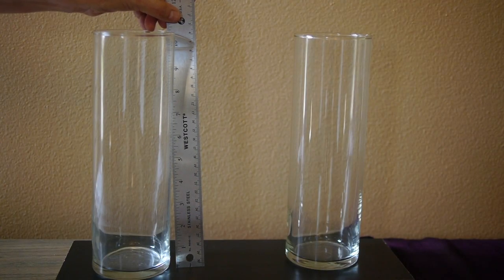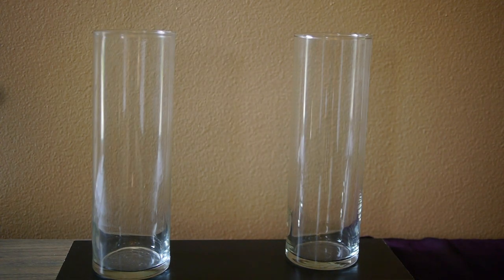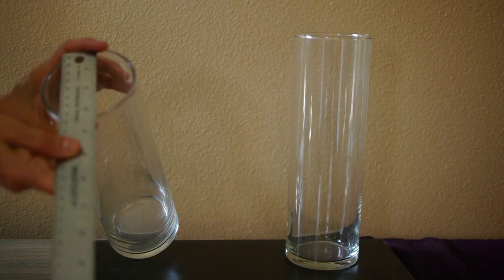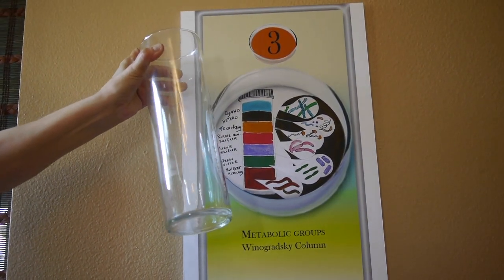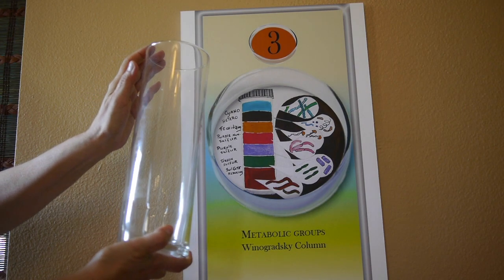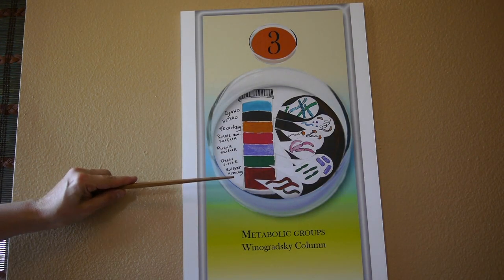You can create this system in a clear glass cylinder like this one, which happens to be 10.5 inches long and about 3 inches in diameter. With this simple yet elegantly contained mini earth, micro whisperers can experiment with different types of light and different types of materials added and be able to observe without a microscope how the microcosm responds by noticing differences in the colors and textures of the strata.